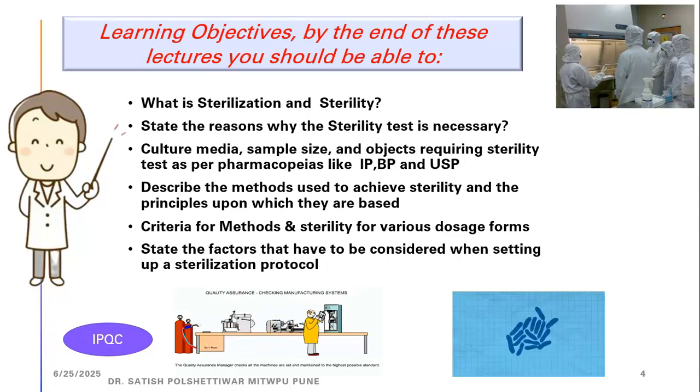Criteria for methods, that is very important, how we can select the method for particular products, and sterility for various dosage forms. And state the factors that we have to consider when setting up sterilization protocols. That is a very important parameter as IPQC parameters.